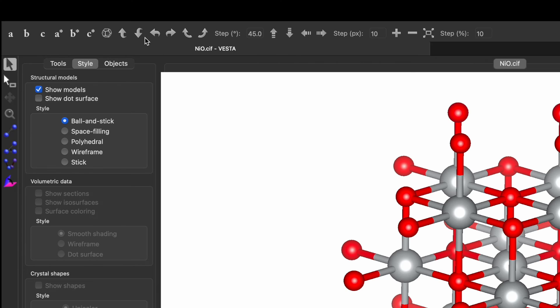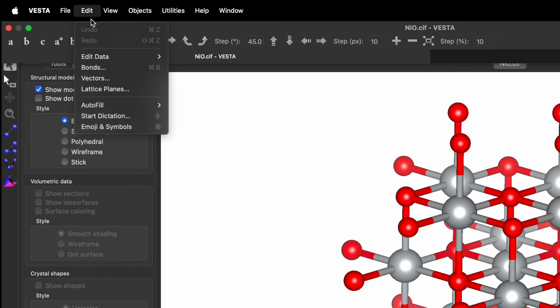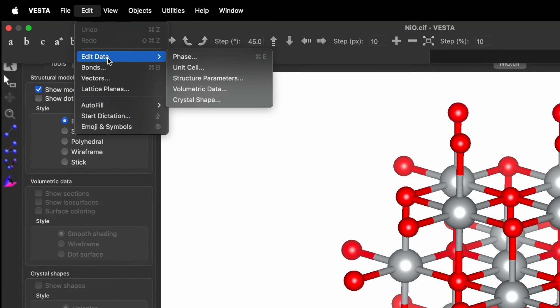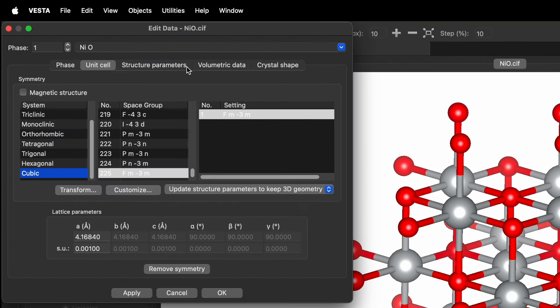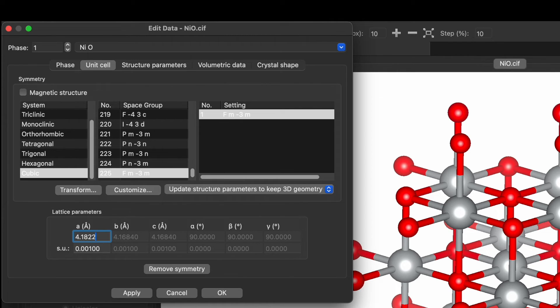Click on the NiO. Go to click on edit. Edit data. Unit cell. And over here you will find the lattice constant. So let's tune this number to 4.22. OK and apply.